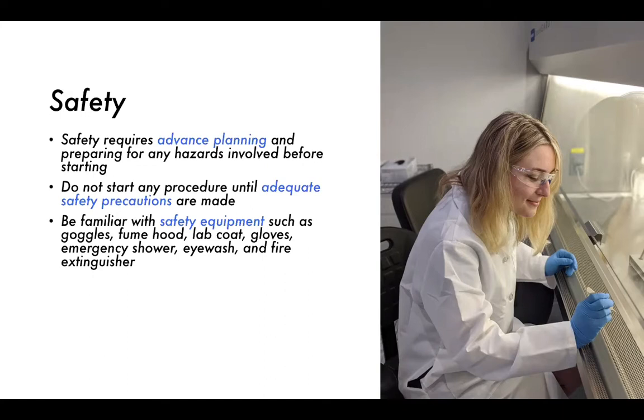The scientist on the right-hand side of the frame here has, as you can see, safety goggles on. They're using containment measures in the fume hood. They have a lab coat. They have gloves. And so they are well equipped to start their experiment or their measurement.